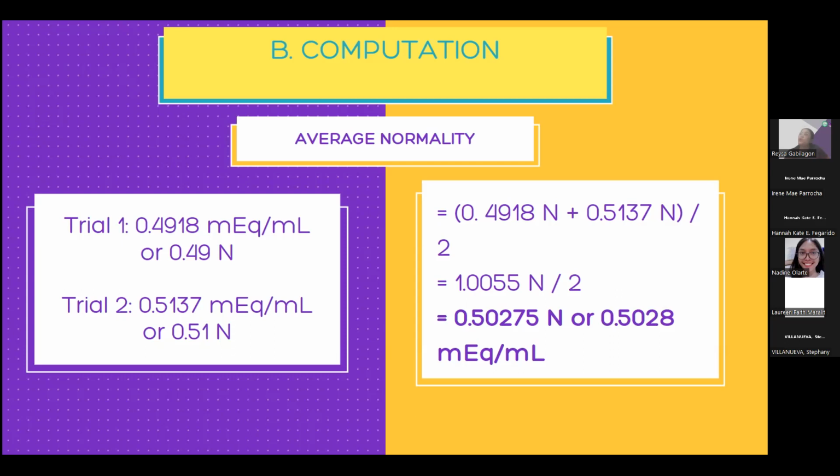And for us to know the concentration, we did the titration process. But again, take note, a secondary standard is what we used here, because it's a solution, a liquid with known concentration, that is coming from your output in activity number 11.